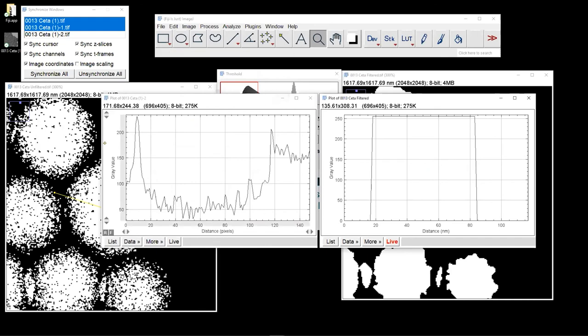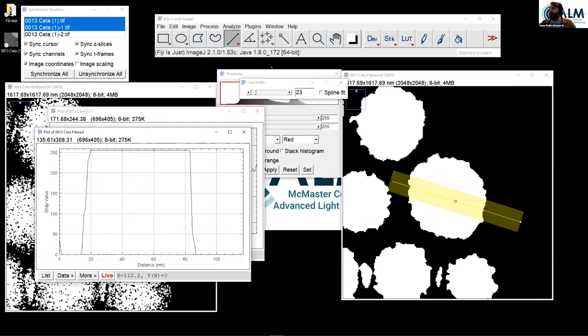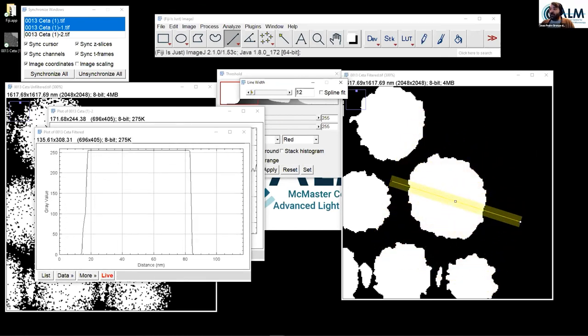Yeah. Okay, good. Okay, so one cool thing that we can also do, and this is something that I think Alex also mentioned, is that we can make our lines wider. So if I click on my line being wider, and again, on this image, you're not going to see major differences, but you see that as I enlarge my line, I'm now capturing this area here. So that's why I start getting these weird averages. So you're actually averaging the whole value in each pixel along this line. Again, this can be quite useful if you want to get an idea about homogeneity throughout your tissue.